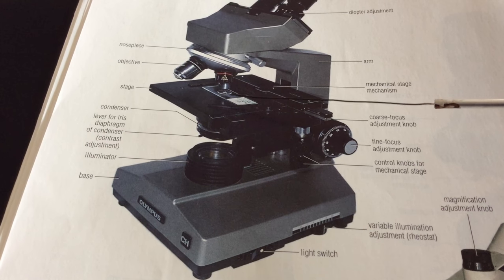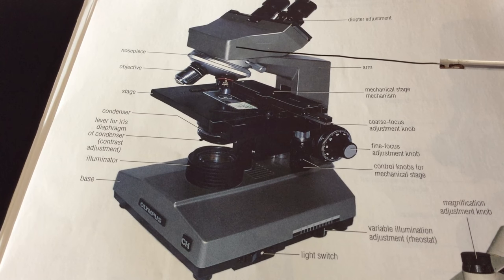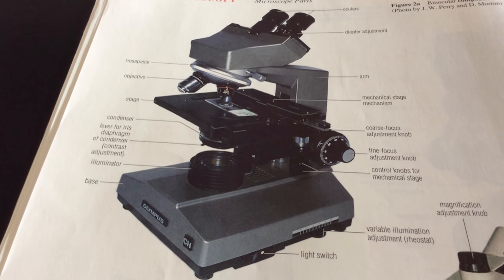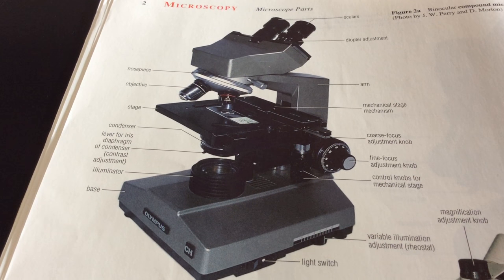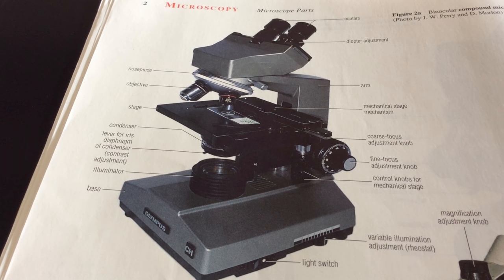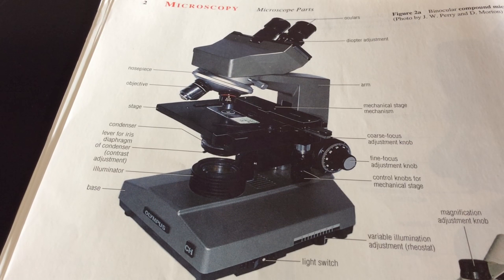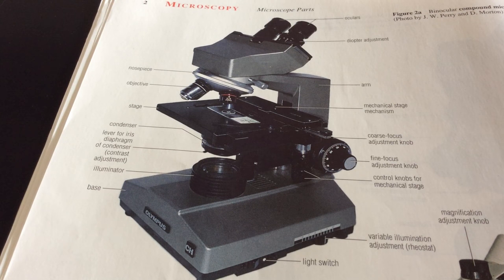The light then leaving your specimen enters the objective lens, and through a series of additional lenses and mirrors, it'll pass through the ocular lenses, and then those photons of light will strike your retina, creating action potentials that will move back to the visual centers of your brain. Each little action potential is a data point, and the more data points your brain receives, the more information it has to create a nice, clear image of your microbial specimen.